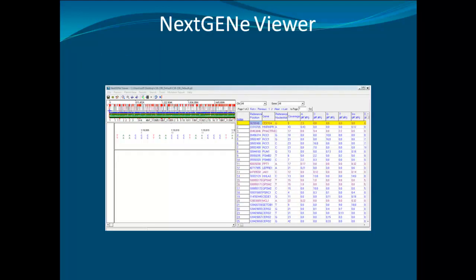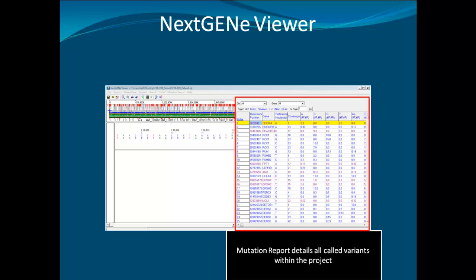When the analysis is finished, the project will automatically open up in NextGene Viewer. The mutation report details all the variants in the project. To display the transcript view, select the transcript view icon.